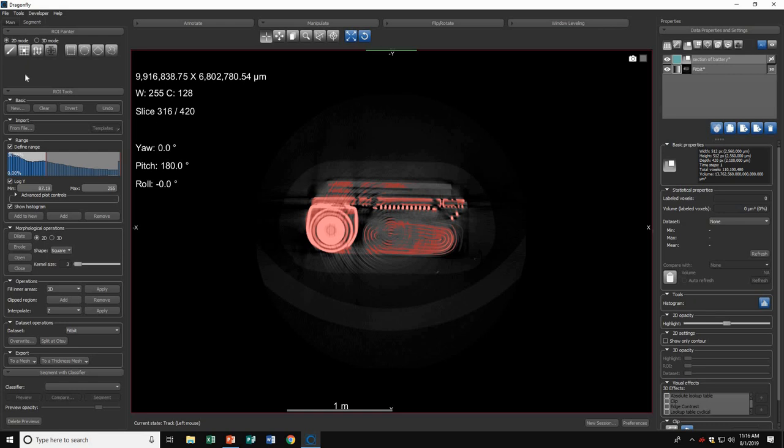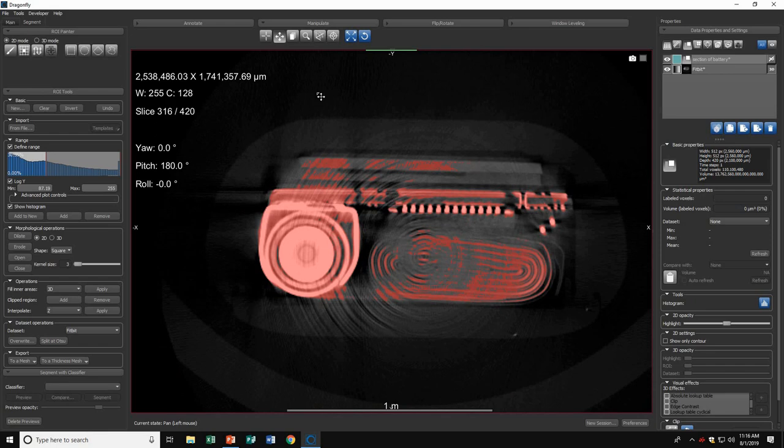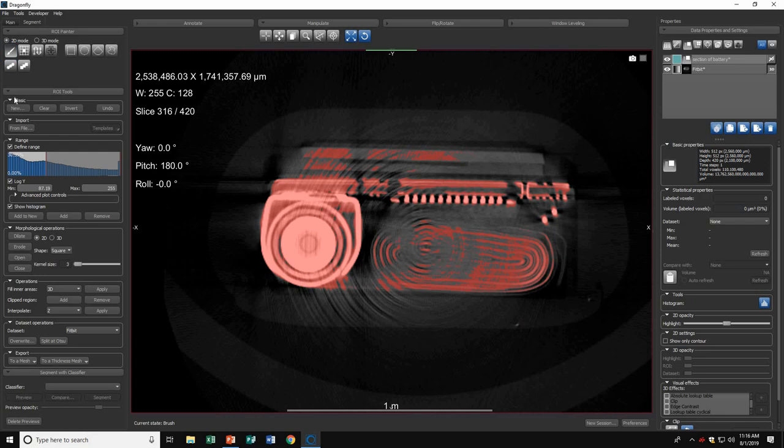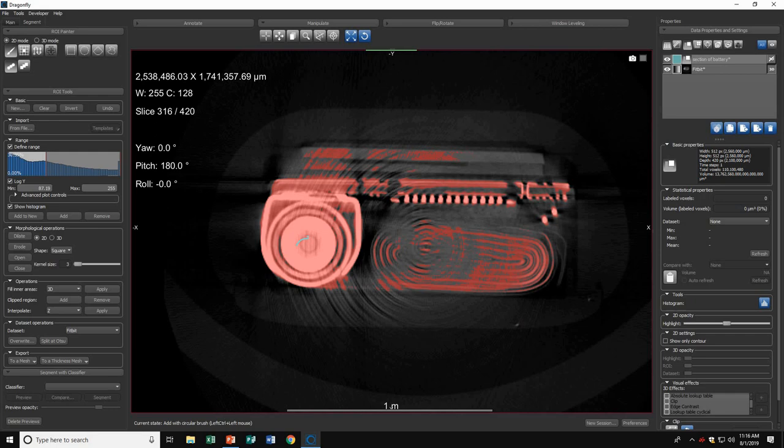I'll zoom in to get a clearer view and hit the brush button. You can choose between a square and a circular brush. For now, I'll choose a circular brush. To begin painting, hit left control and left click to paint the region you want to look at.